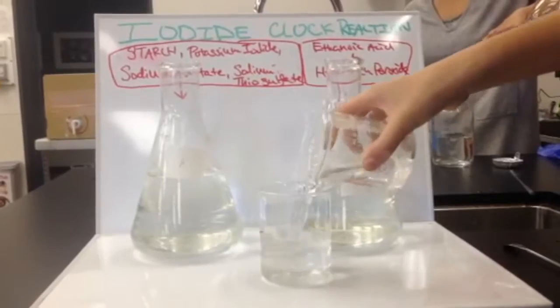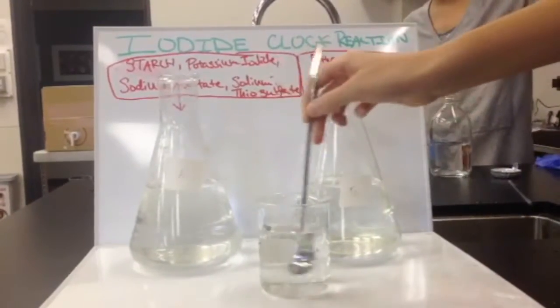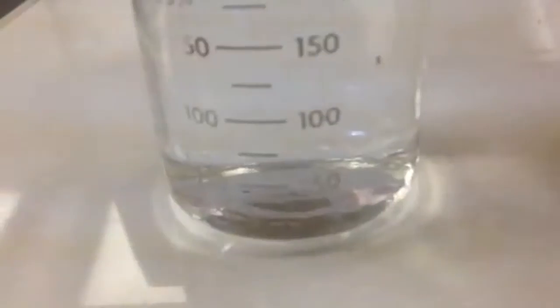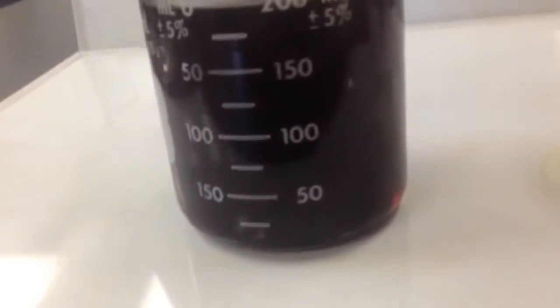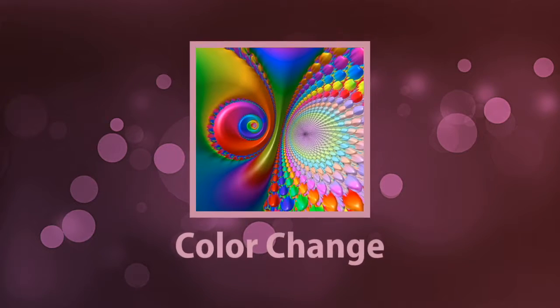I mix solution A, which consists of starch, potassium iodide, sodium acetate, and sodium thiosulfate, with solution B, which has ethanoic acid and hydrogen peroxide mixed. Both are colorless solutions. However, when they are mixed together, in a matter of seconds, the beaker turns magically black. This reaction shows one of the 4 main types of chemical reaction, which is a color change.